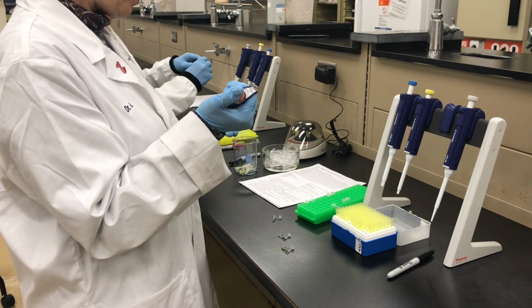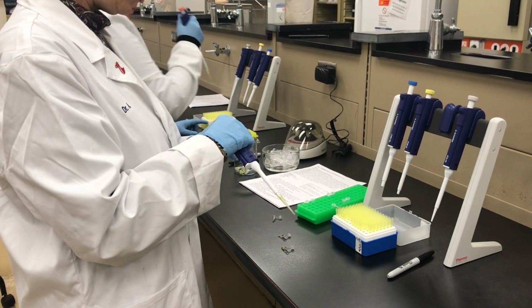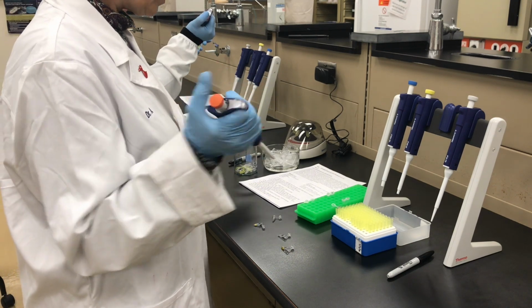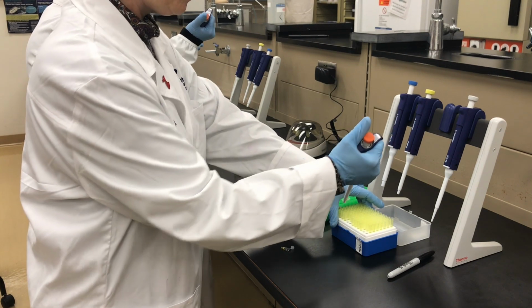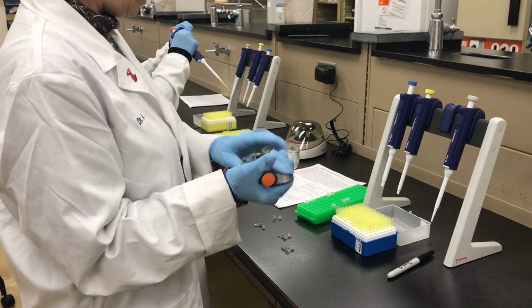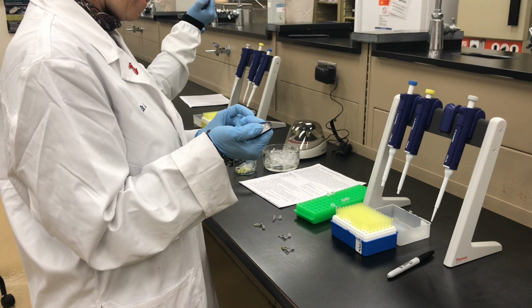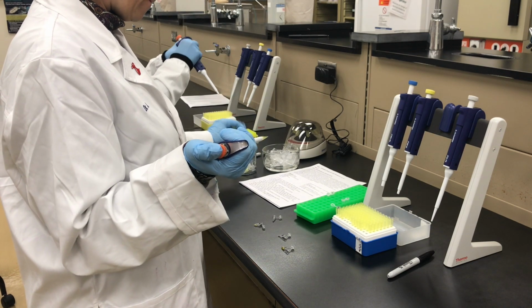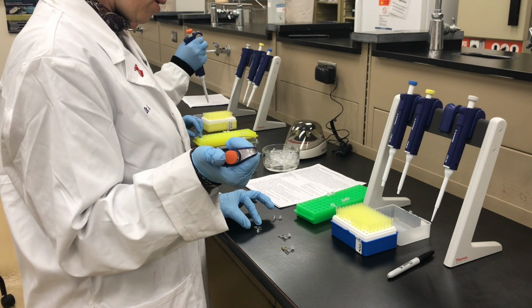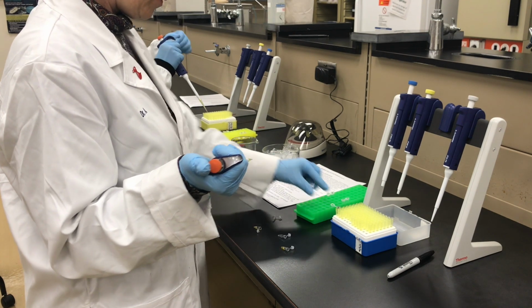So the primer was 20, water was 15. Oh, I don't want to close it. There's 2 ones. So now I'm doing 15. I'm going to use the same orange top. Dial it to 15. Now the water tube. So the white ball has water and primer.